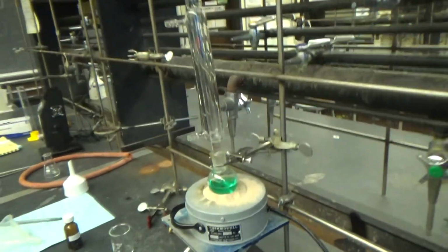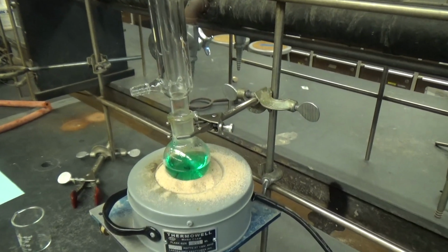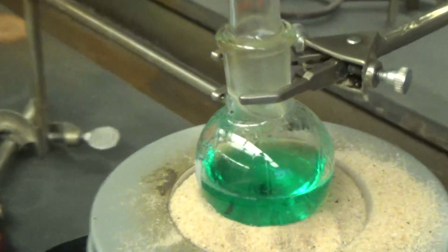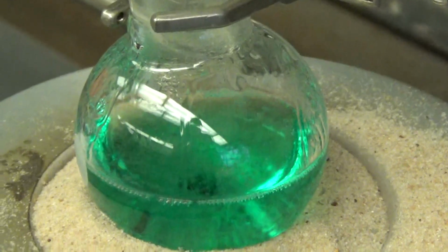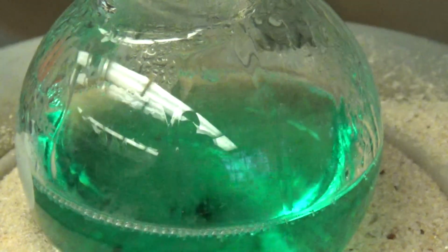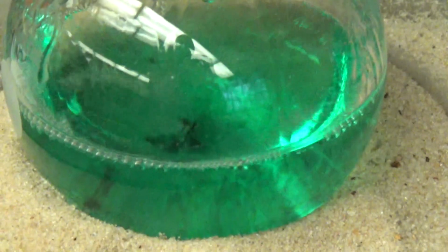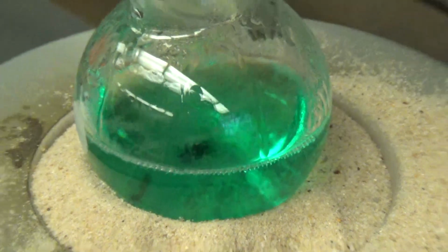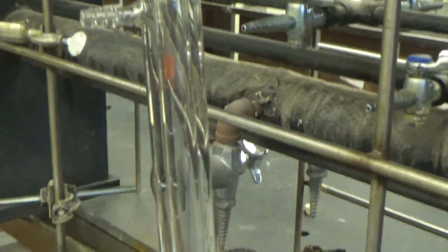Alright, let's inspect this thing. You have done a lot of radical chemistry in your PhD. I did a lot of radical chemistry in my PhD. Different stuff. Look at that. It's pretty cool. It's sort of boiling and probably reacting. And in this condenser, we don't use water, right? No water.